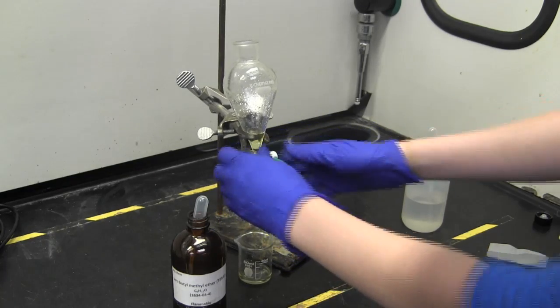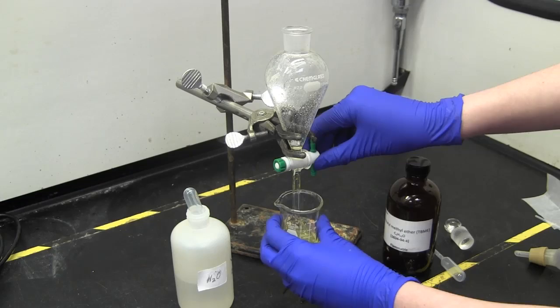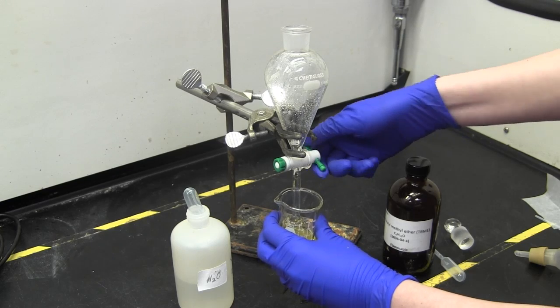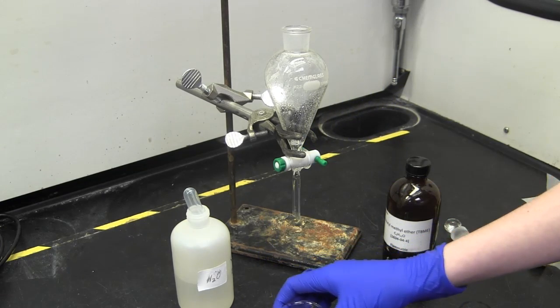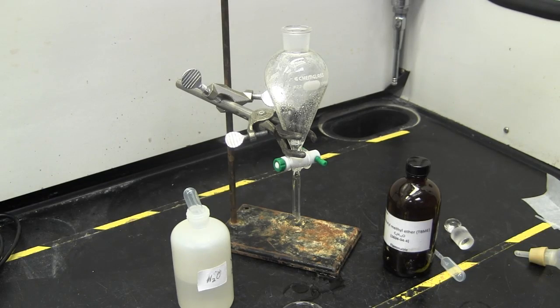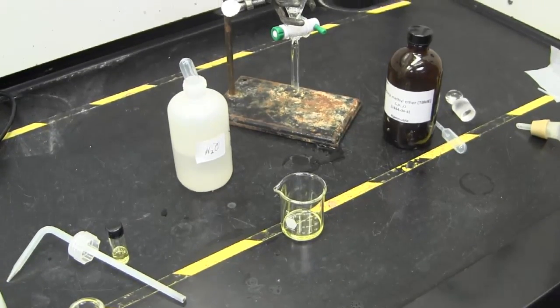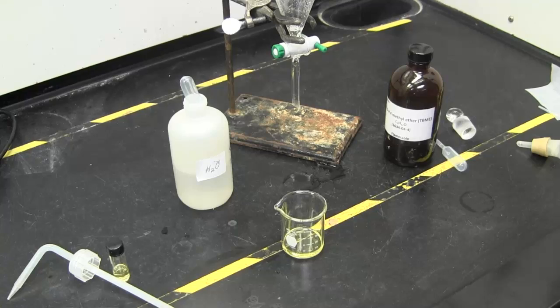To determine which layer your unknown is in, you know that glucose is the impurity and that it is soluble in water. This means that your unknown will be found in the TBME layer. This layer is called the extract. Determine which layer is which by finding the densities of the solvents. The lighter one is usually on top.